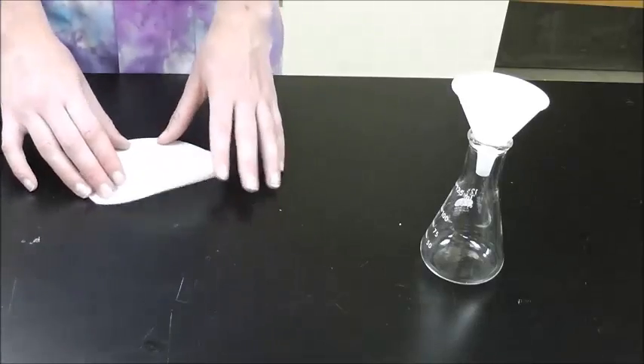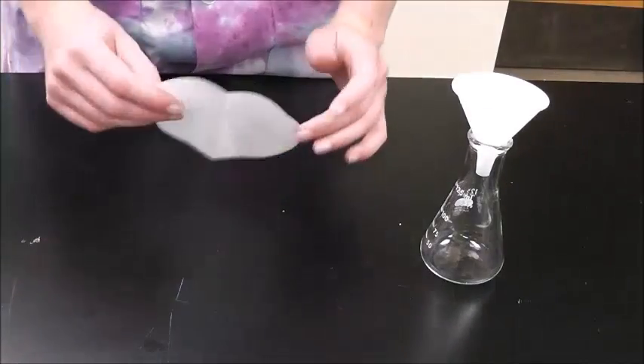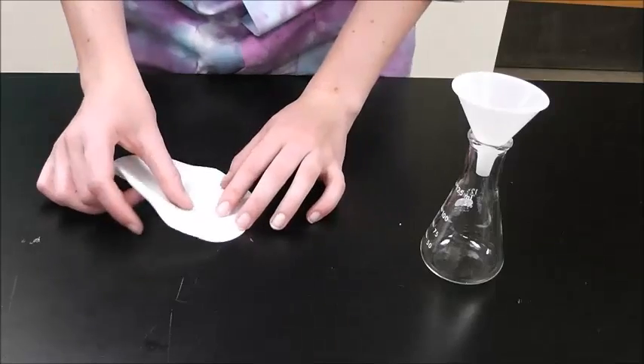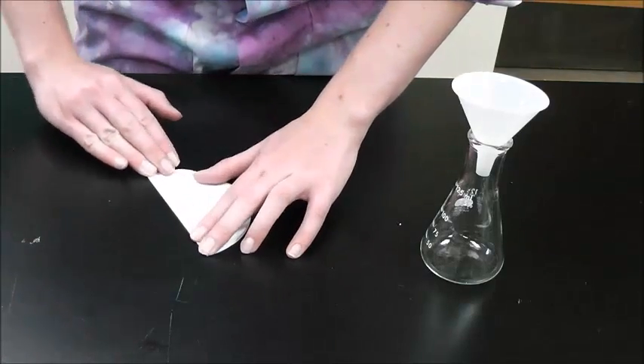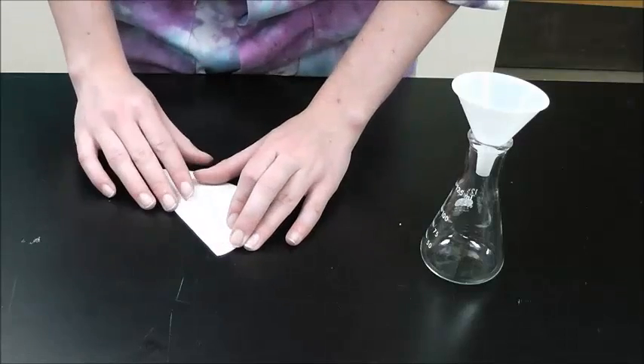Your filter paper should now be divided into eighths. Then flip it over on the bench, and repeat what you just did, placing the folds midway between the folds made on the other side.